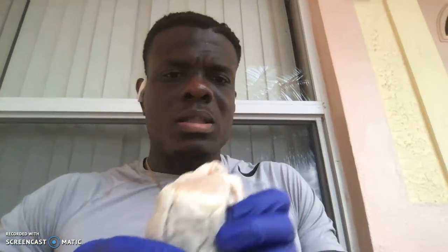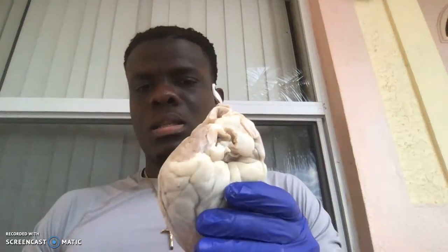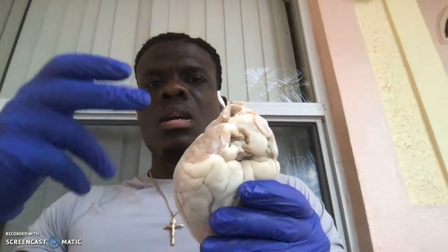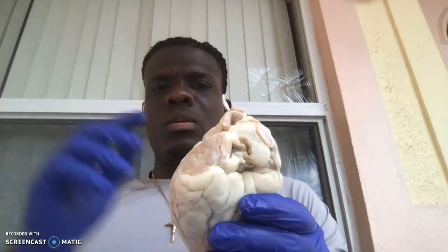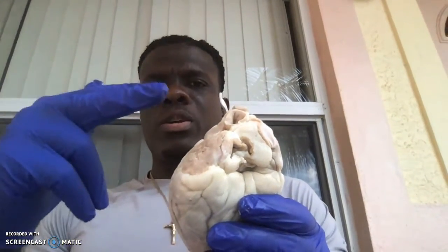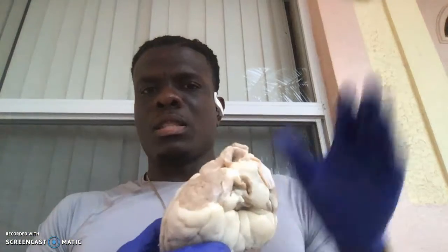So looking at it, let me see if I can angle this in a way that you can see. It's gonna be hard to see. But I'll try to describe it as much as I can as it's facing me, basically. This is basically the apex right here. This is the base. So this is my right hand. So over here, you have the left atrium and the left ventricle is right over here.